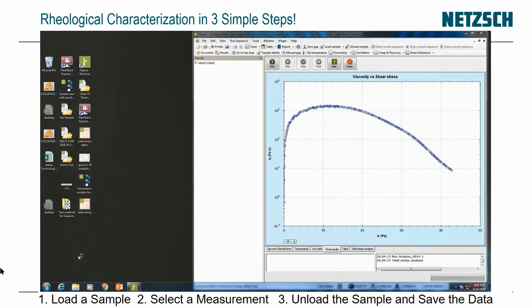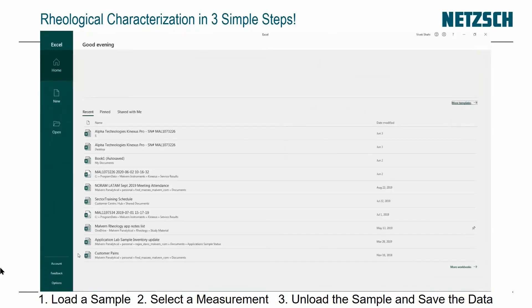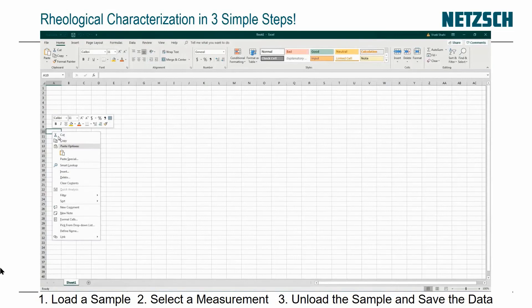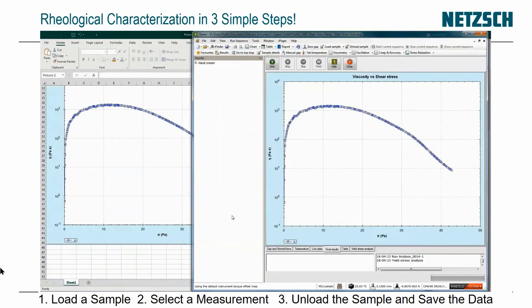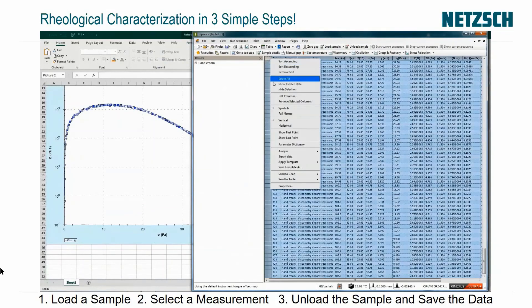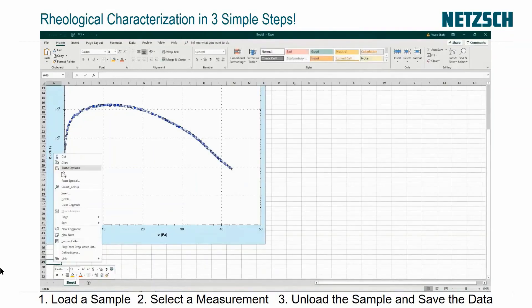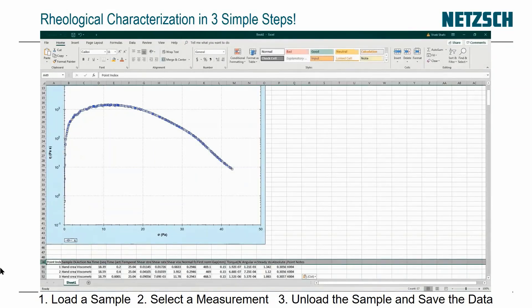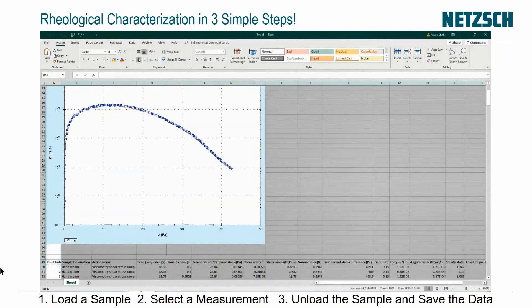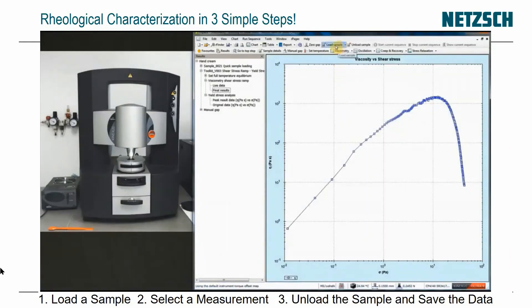I'm going to export the data. I'd like to put it into Excel, so I open a new blank workbook and paste it in. Going back to the software, I go to my table of results and click Copy to Clipboard. Then I click the cell where I want it to start and paste it. It goes right into Excel so you can format it, make the columns the right width, and there's your graph and data immediately exported.